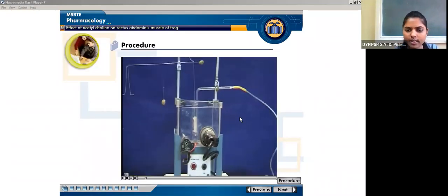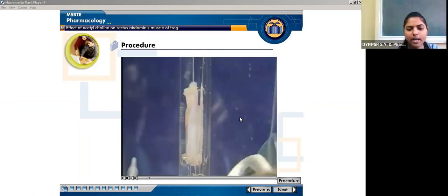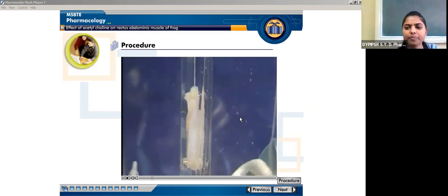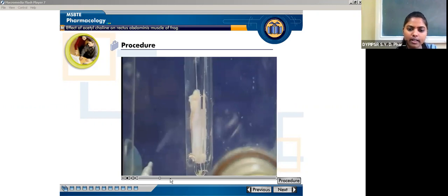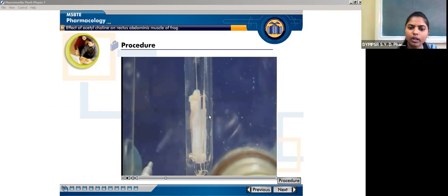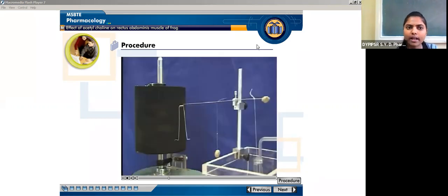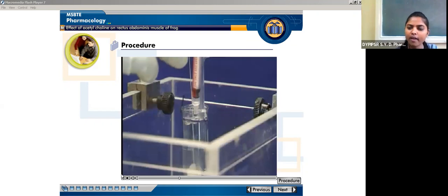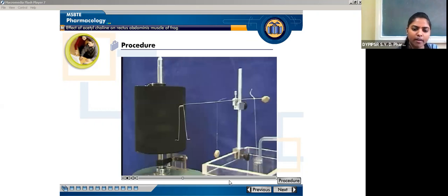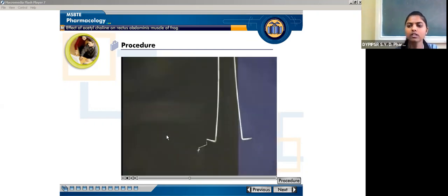The isolated tissue is placed on the student organ bath assembly and washed three to four times with frog Ringer's solution. Then we begin administering doses of acetylcholine. We first adjust and observe the baseline on the rotating drum, and after administering the dose, the response — measured as the height of contraction — slightly increases with each dose.